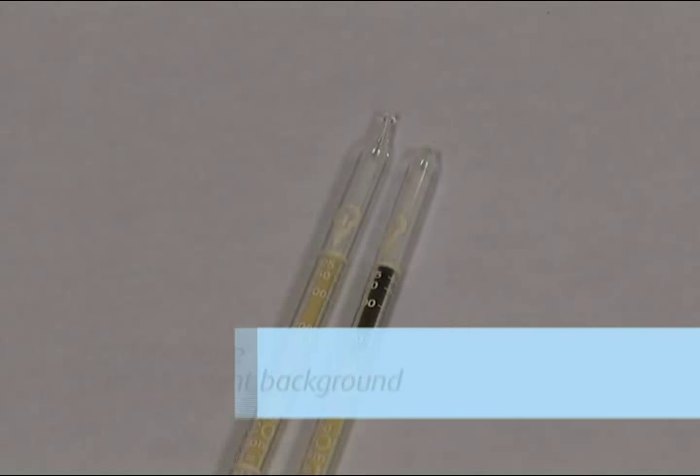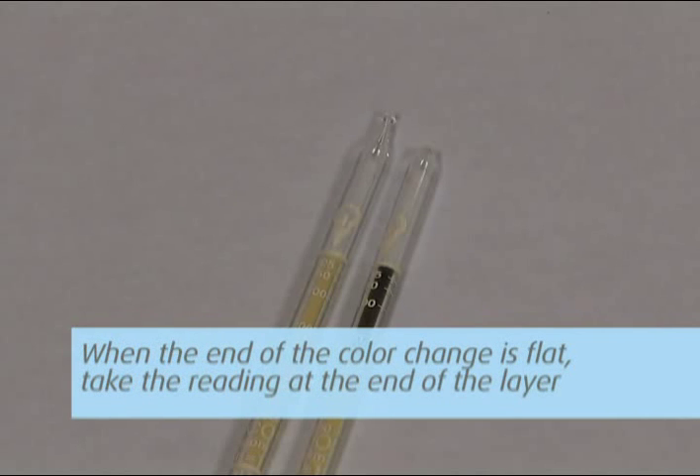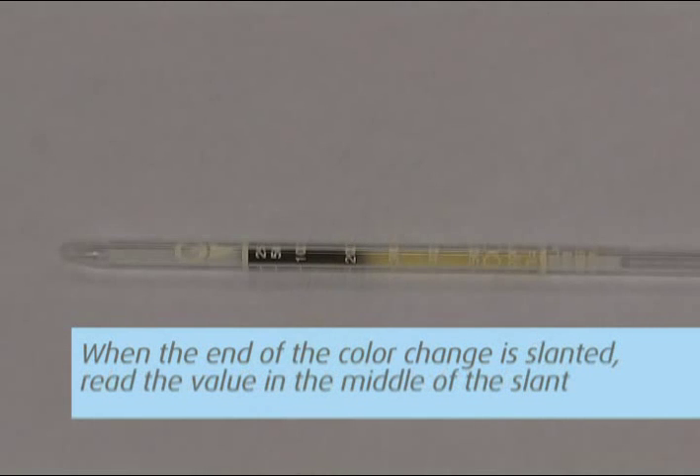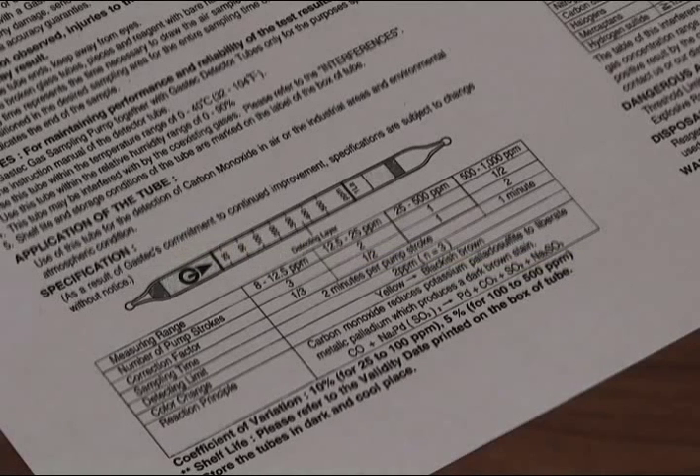Take your sample reading. Hold the tube against a light background. When the end of the color change is flat, take the reading at the end of the layer. When the end of the color change layer is slanted, read the value in the middle of the slant. When the demarcation of the color change layer is pale, read the value in the middle between the dark layer and the pale layer end.